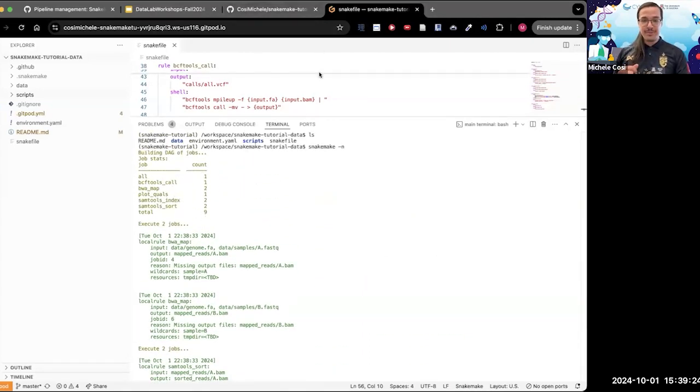Coming back to the general question over here. So what does the dry run do? The dry run creates, first of all, the DAG of jobs, the directed acyclic graph of all jobs. So as you can see, that's the first thing Snakemake does: can I run the pipeline? The answer is yes, then it moves on. It calls on each single workflow rule that there is, in the way that they are described in the snake file itself, such as first thing you do.